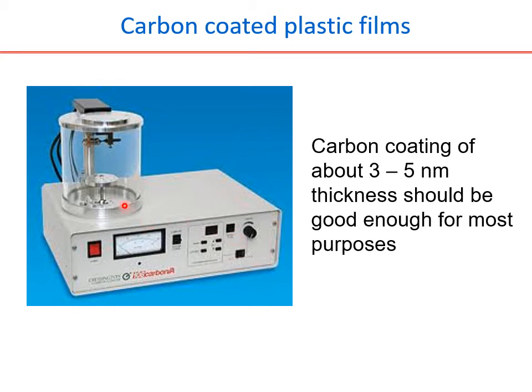So what people usually do, of course this is off the record, is place the lid of a plastic bottle here with a wax coating on half of it. Then don't ask me where the wax is coming from. Your human skin is the best source of the wax. Just use your hand, touch your nose, touch a part of your plastic lid and place it here.